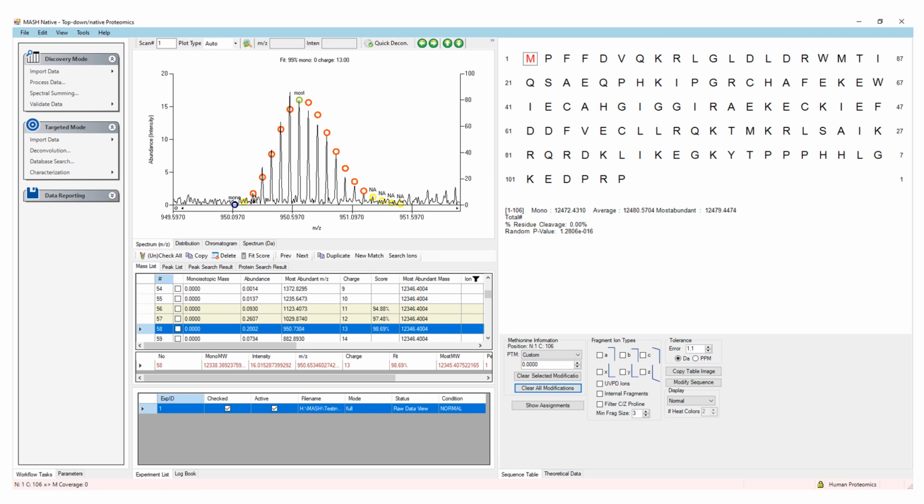If we look at the difference between our sequence mass and our selected mass in the mass list, there is a difference of 133.047 daltons. A very common occurrence to consider is the cleavage of the N-terminal methionine.